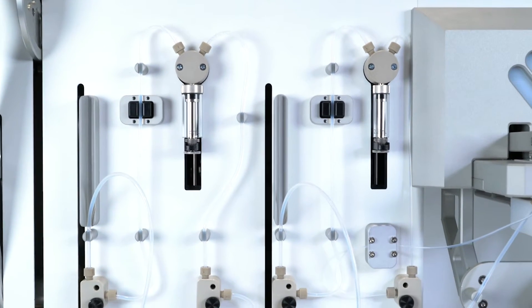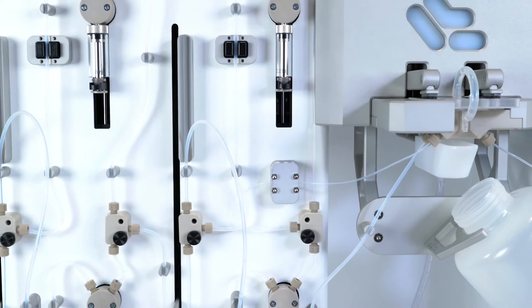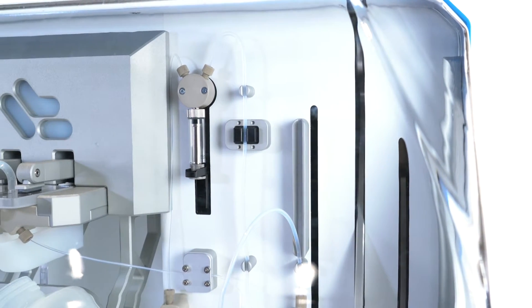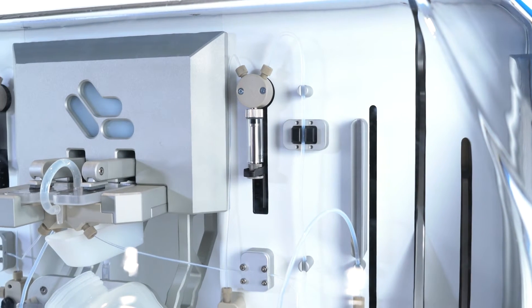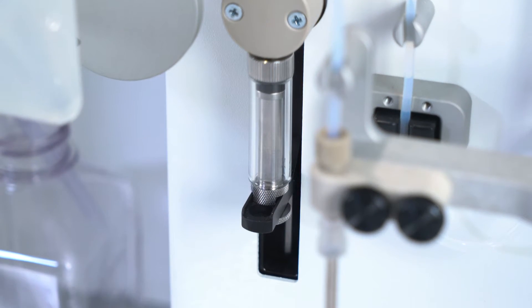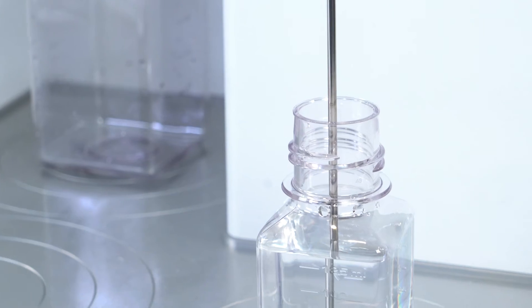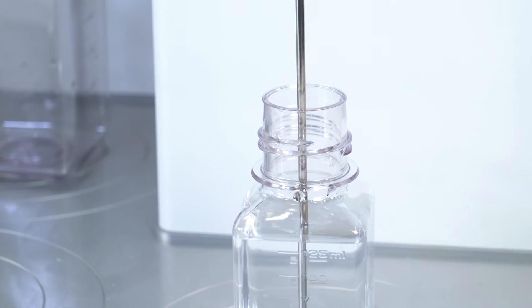That gives us a lot of control in how we control the mixing speed through the flow rate through the microfluidic mixers, independent control of the different channels going into the inputs so we can modulate things like flow rate ratios between the two fluids going into the microfluidics.